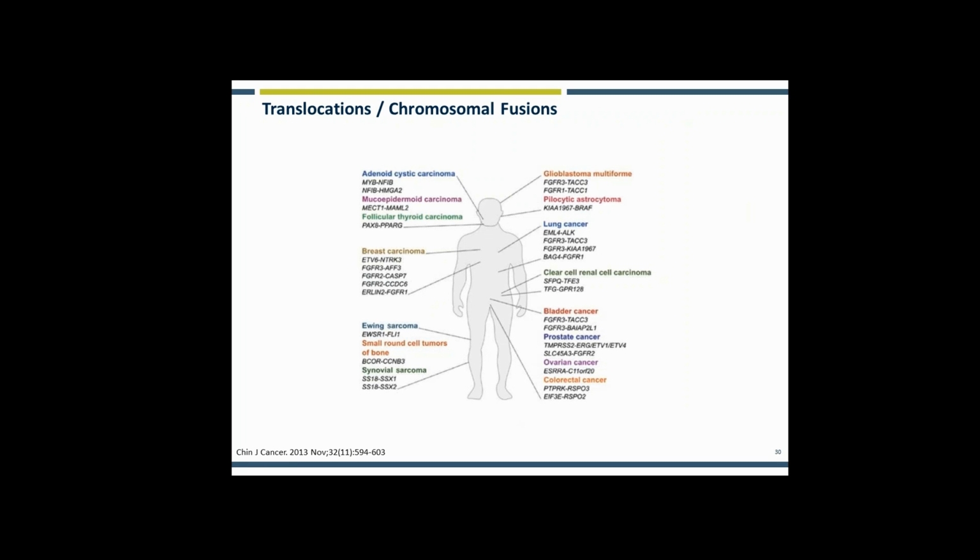Next up we wanted to experiment with introducing translocations. There are a number of translocations that are associated with cancer. Perhaps one of the best known is the EML4 ALK translocation. And so it was desirable to us to be able to recapitulate these in a model system for the same reasons that we'd want to introduce disease-associated point mutations, for example, so that we could study the role of these translocations in driving disease and in phenotypic analyses.